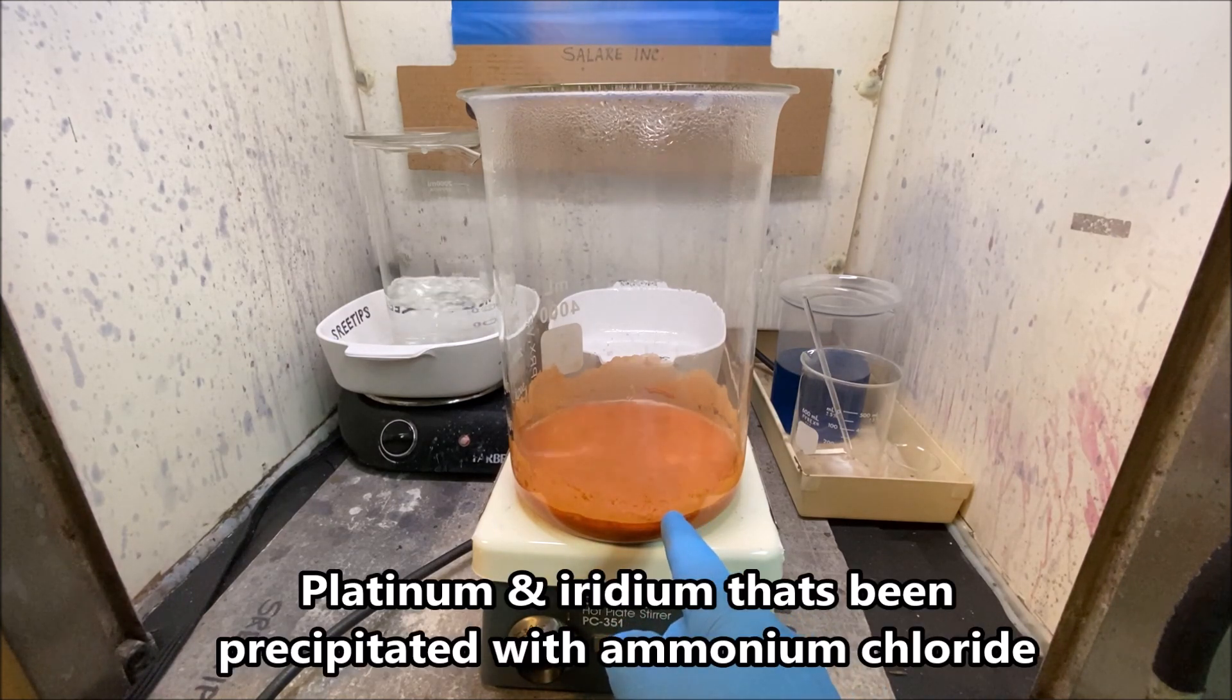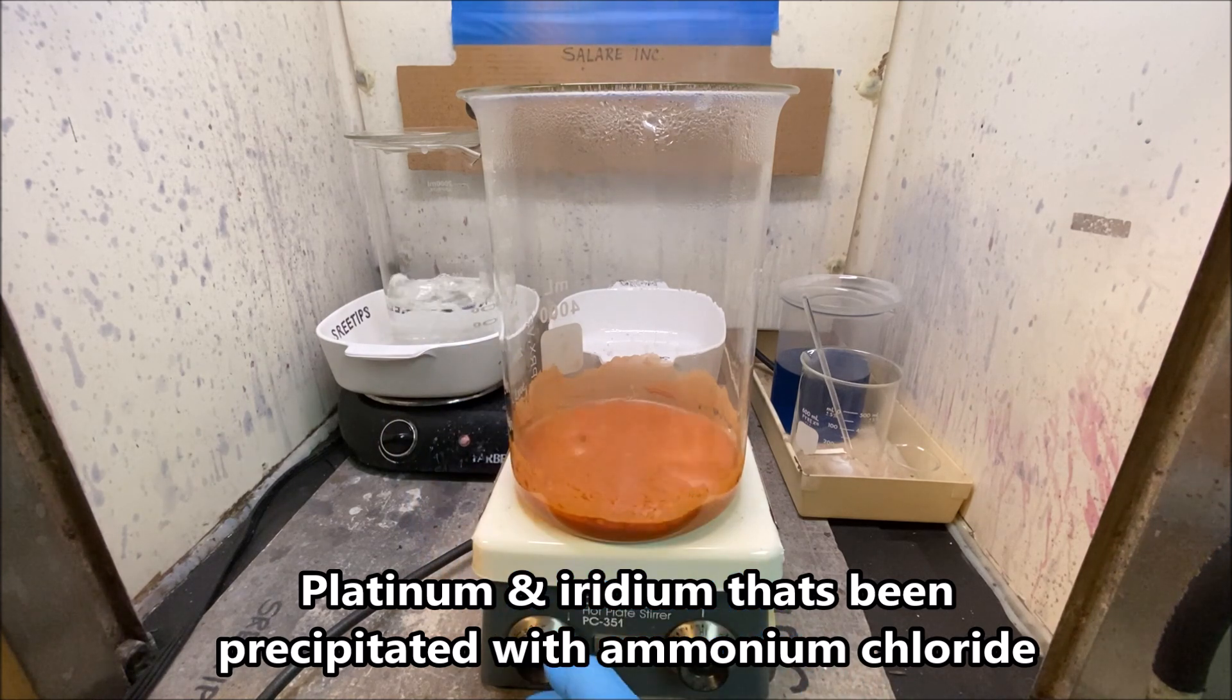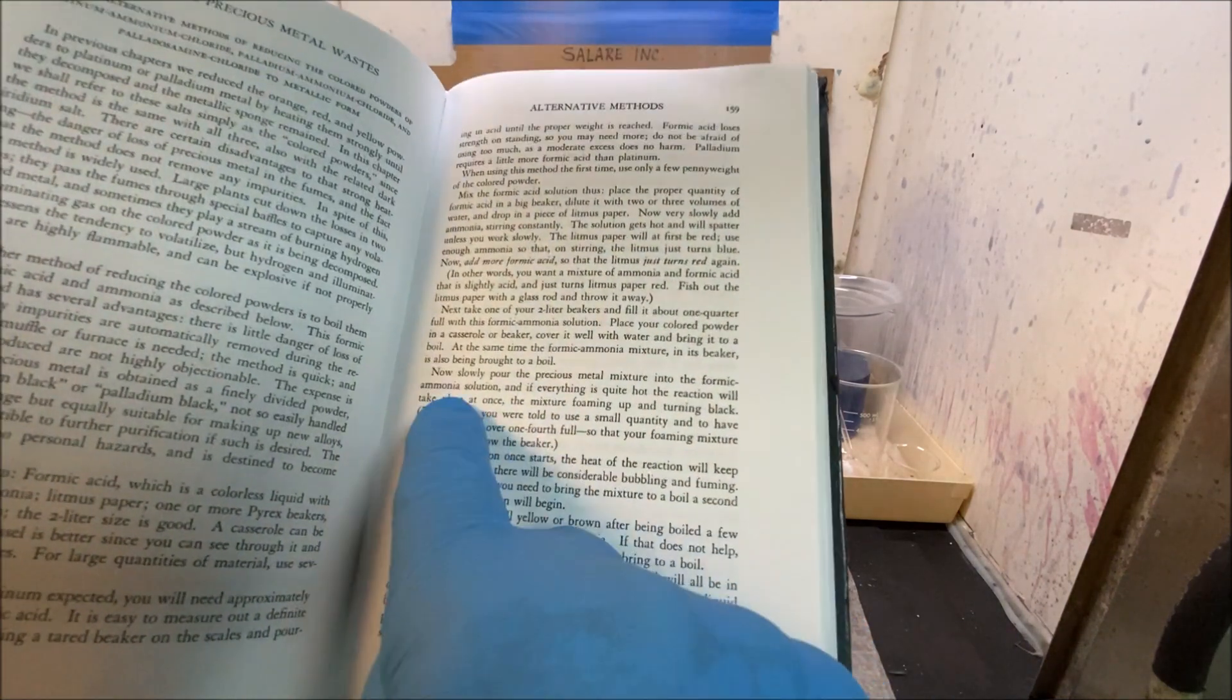As you can see, the solution is boiling here. The formic acid ammonia solution is boiling. I turn my stir bar on so I don't spatter a bunch of stuff here.